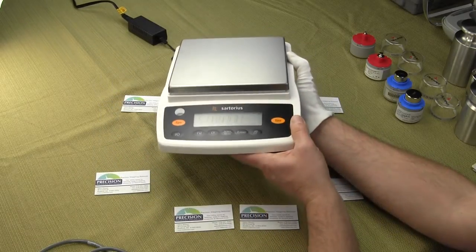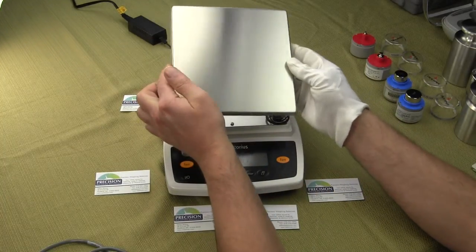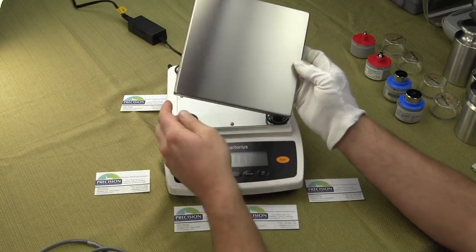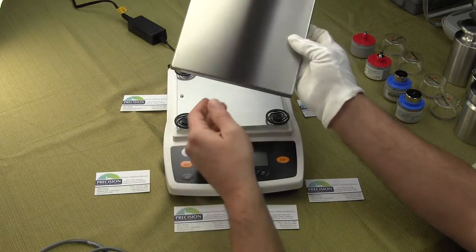This particular balance goes to a hundredth of a gram and it has a 7.1 by 7.1 stainless steel platform that's removable for easy cleaning.